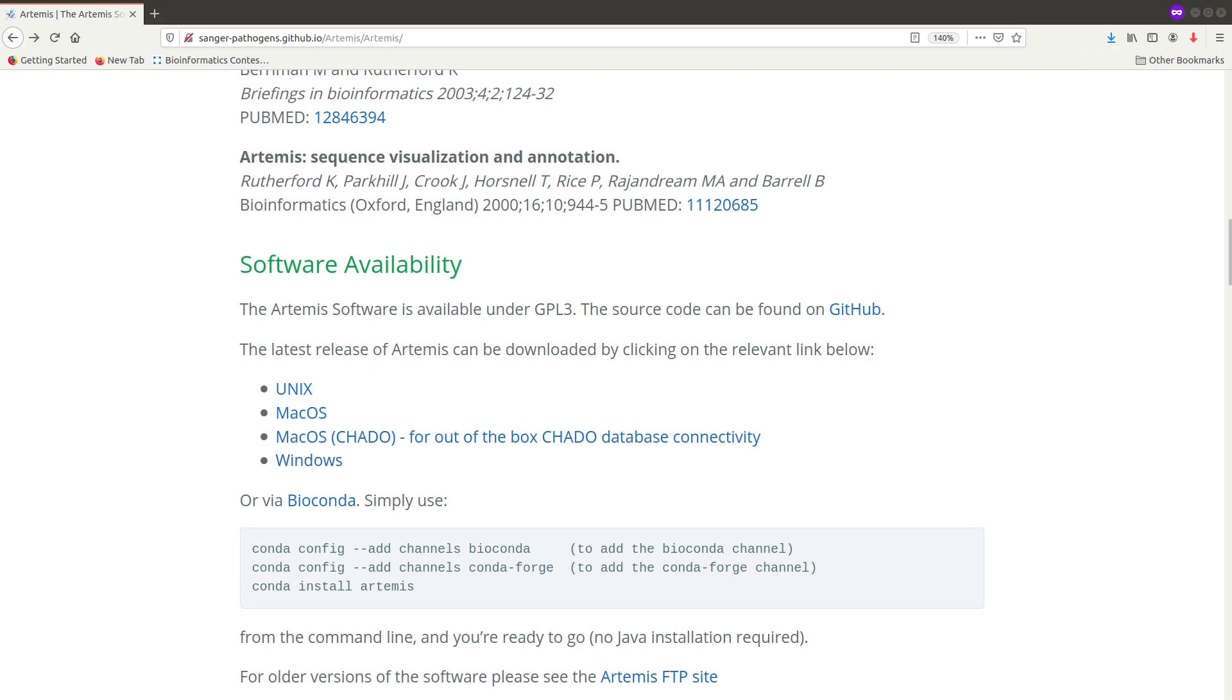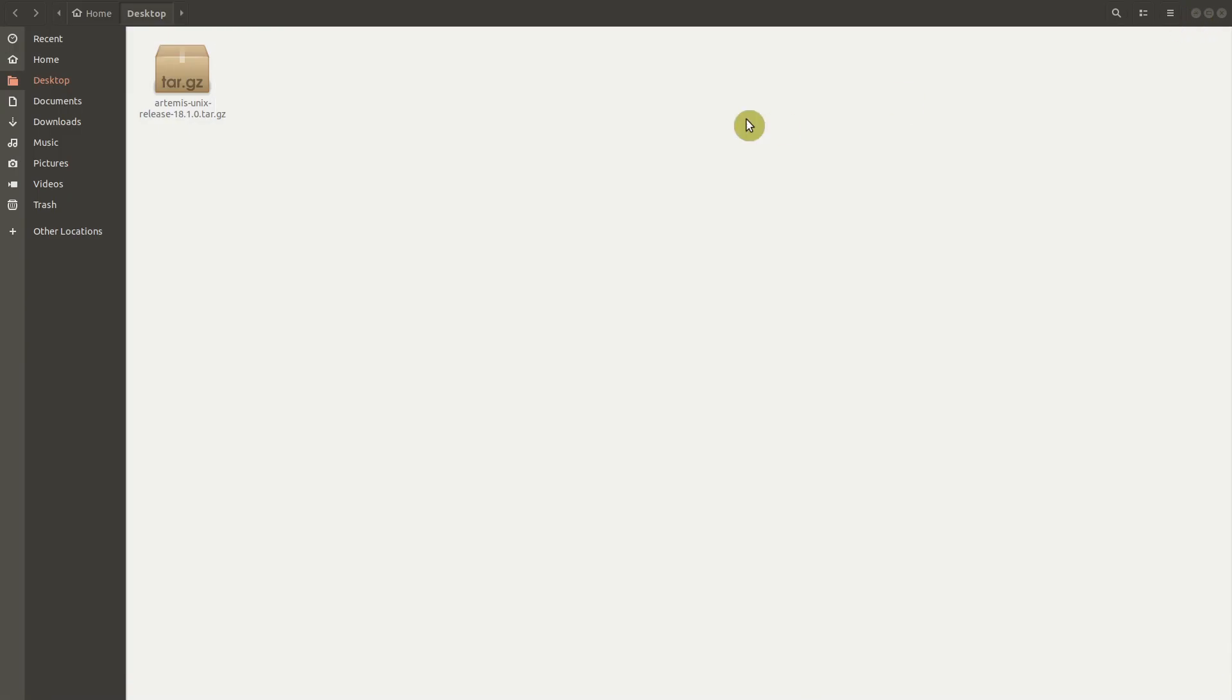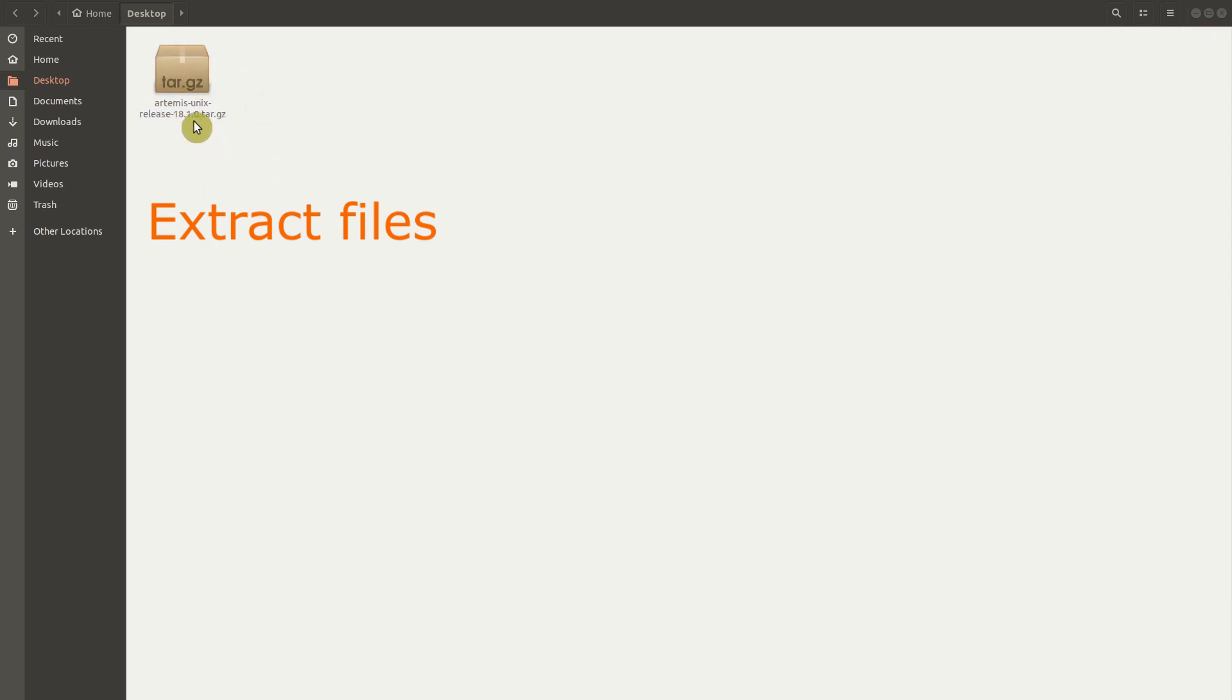So download is now complete. So we'll check where it was saved to. I saved it on my desktop. So this is how it's going to look like. You should know that whatever you download is a compressed format. So we need to extract it first.